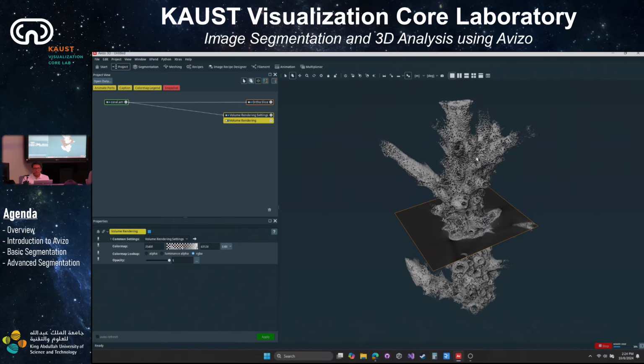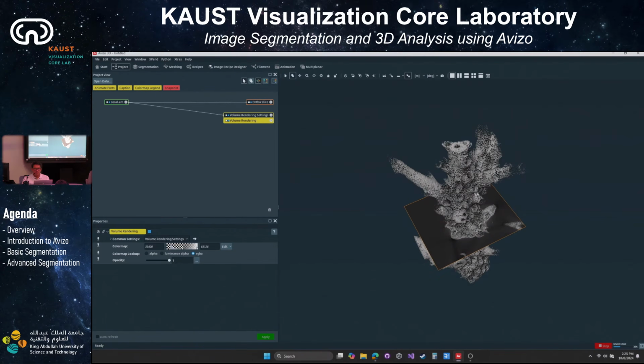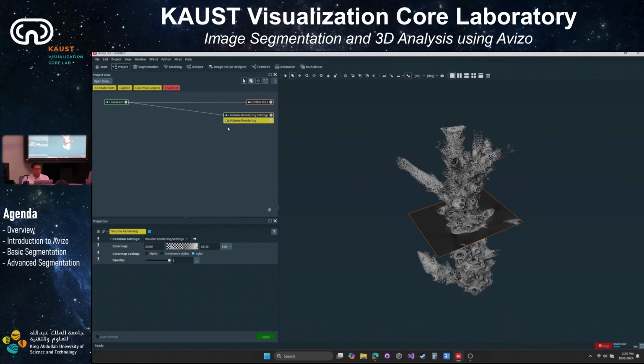For instance, if you want to measure, let's say, coral growth, this is kind of a process that you can try to do, right? So you can scan a coral before, then let it grow for a few years, I don't know, and then rescan it again. Probably not by CT, maybe some other method. But once you have both scans, you can generate the 3D model from both, or measure the surface area from both and measure how much it grew, right, in terms of surface area. So for today, we'll just do it for one coral sample. Okay, so let's do that right now.